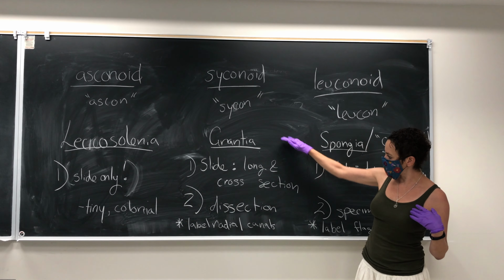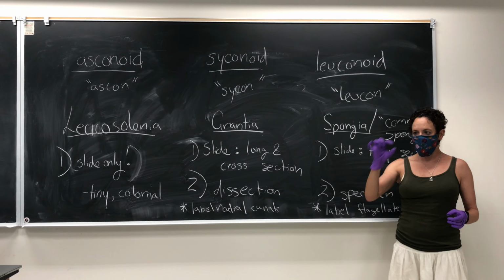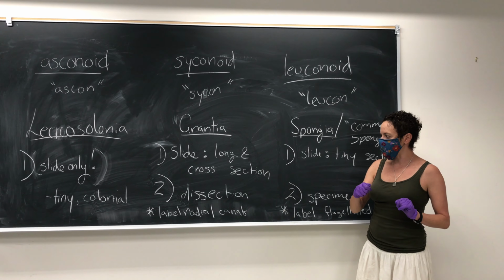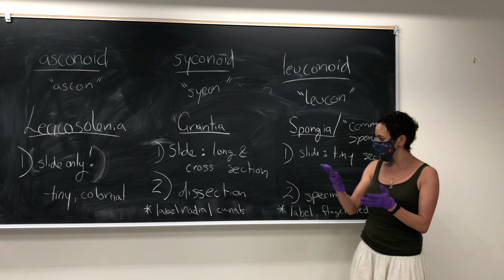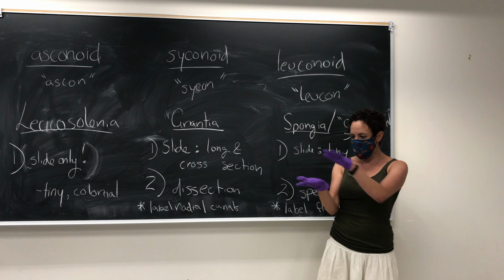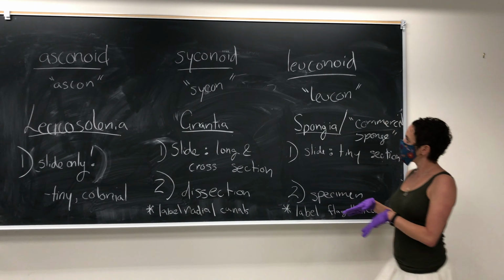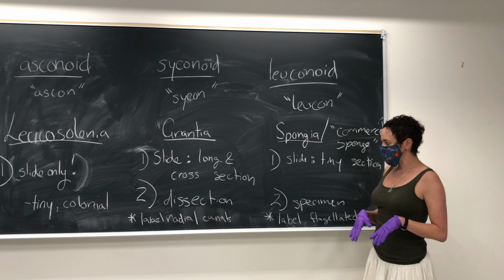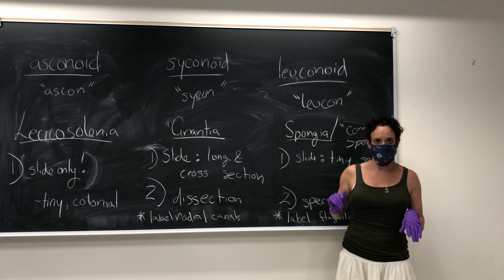So you have a slide of Grantia, but we're also going to do a dissection of Grantia. They're not very big, about yay big, so I'm going to show you how to pull them out, and then you're going to use a razor blade to cut them in half. We have photographs of what you should be looking at under the dissecting scope, both the inside and the outside of the little Grantia. We also have some bigger specimens that show you that the syconoid sponges can actually become quite big.